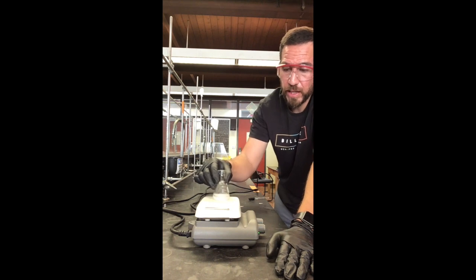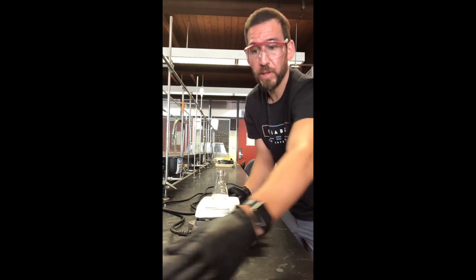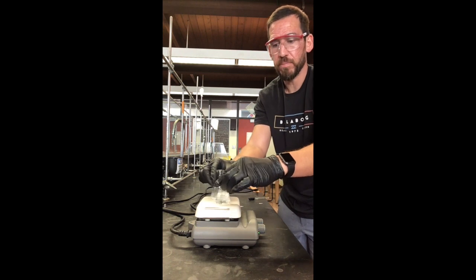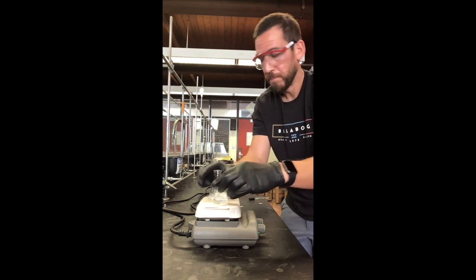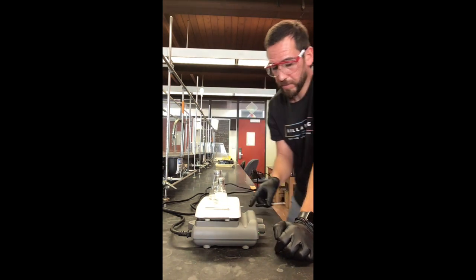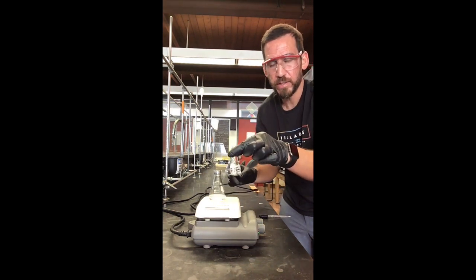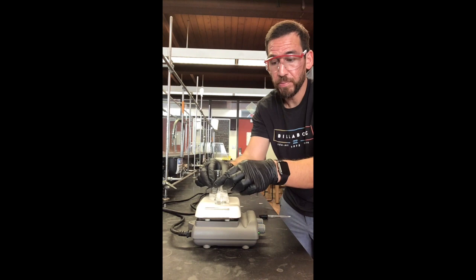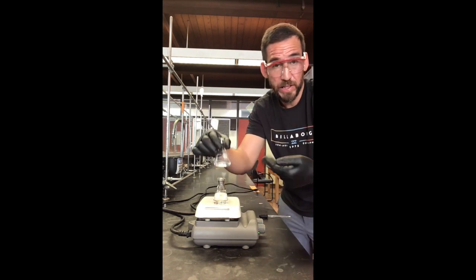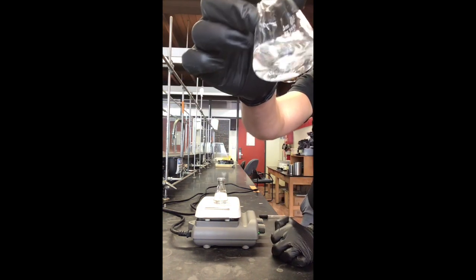So once it starts boiling, if you find that not all the material is dissolved, what you can do is actually have one of these guys on here as well, and then I'll be stirring both of these at the same time. And then I also have my medicine dropper, okay? And this medicine dropper is going to allow me to take a little bit of this hot solvent that's just ethanol and place it inside of the recrystallization flask, okay?